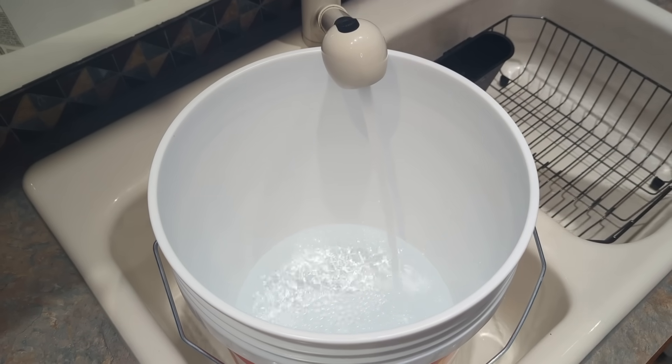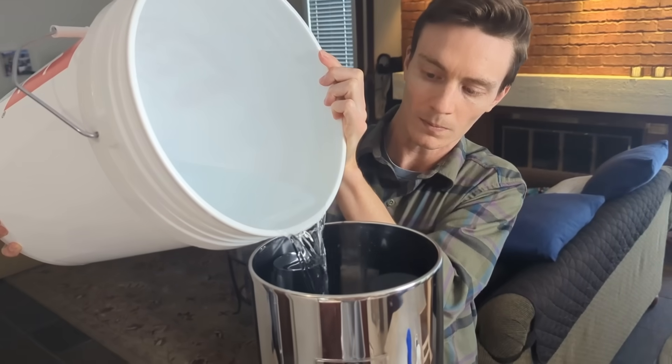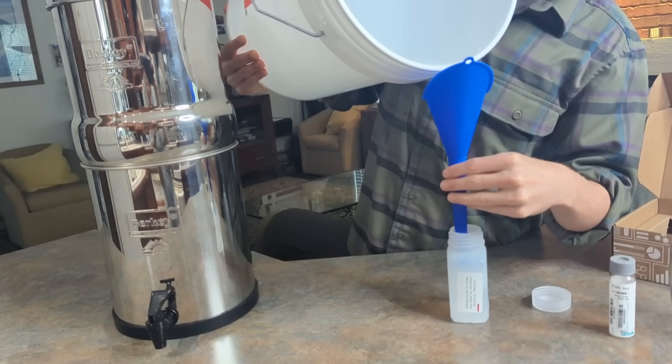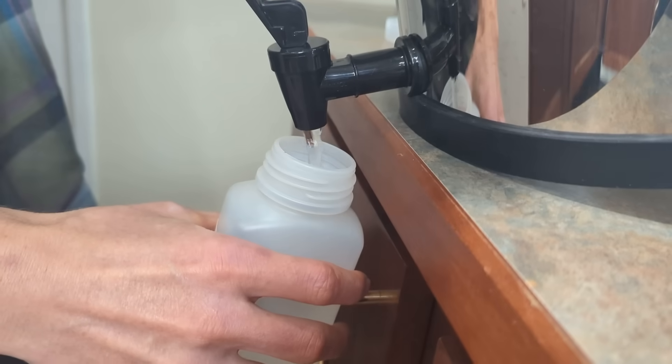In order to ensure the most accurate results from the lab, we followed a strict sampling process. First, we collected the water sample in one large bucket, swirled it around to get it well mixed, and then filled the Berkey directly from the bucket. We took the pre-filtration samples directly from the bucket as well, and then took the post-filtration sample from the Berkey.